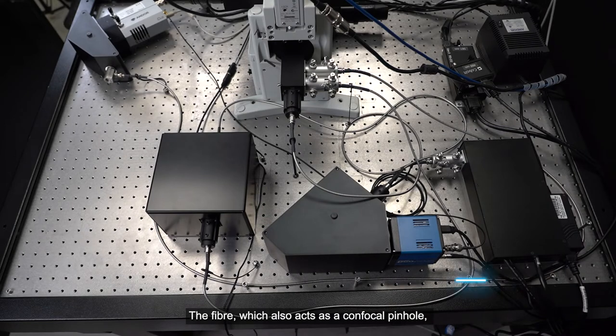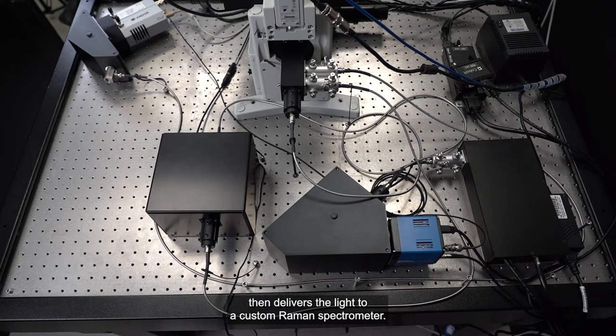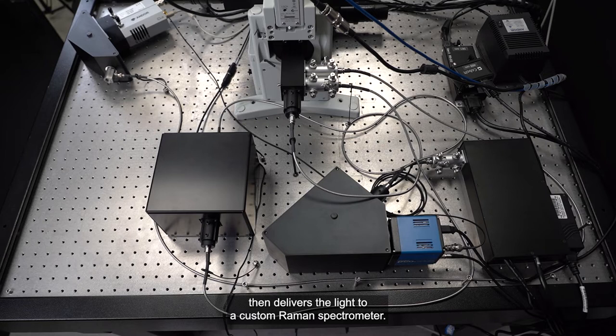The fiber, which also acts as a confocal pinhole, then delivers the light to a custom Raman spectrometer.